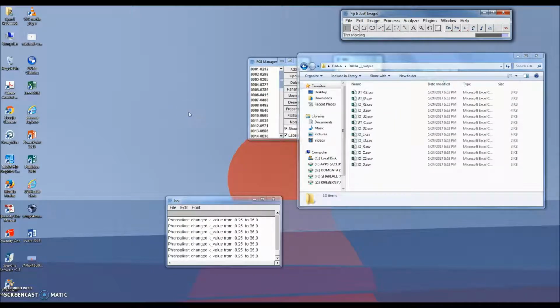And this has the benefit of being a lot faster, but it also doesn't provide the same way to double check your images and make sure that you have less than 7 multiples per image. So this is a lot faster in the end, but it may result in slightly lower quality data, and should really only be used when you're comfortable that your images have the cells spaced out pretty neatly.